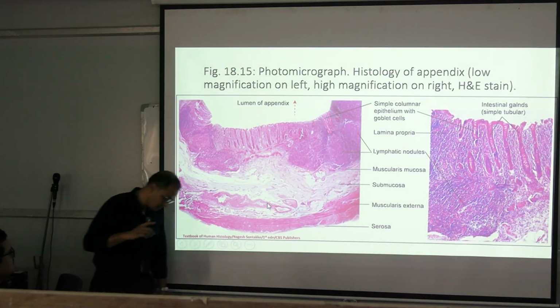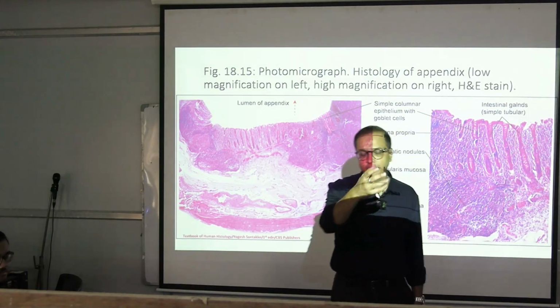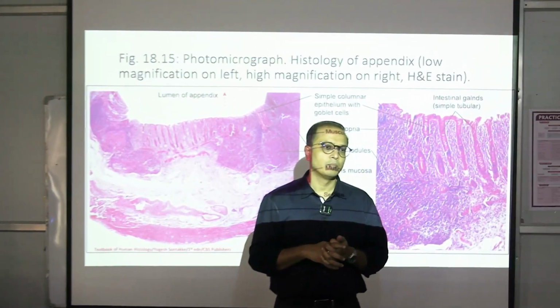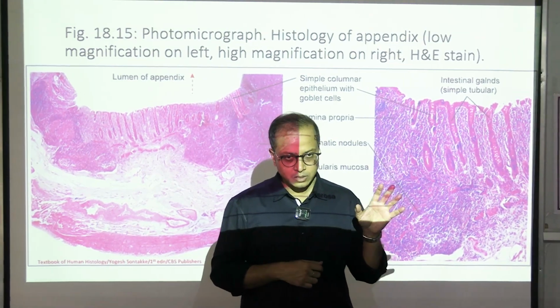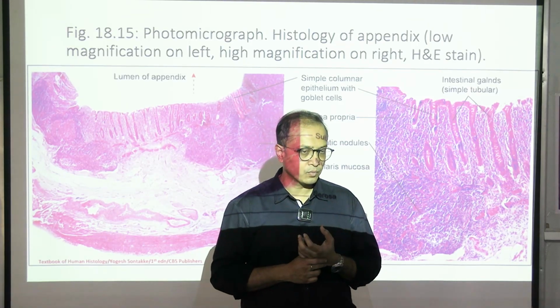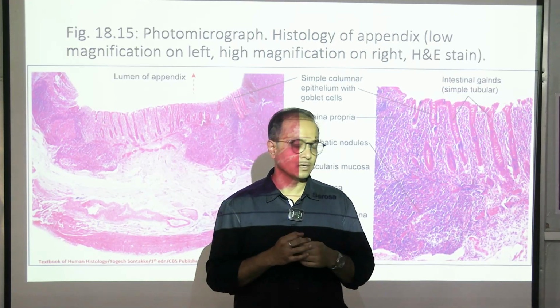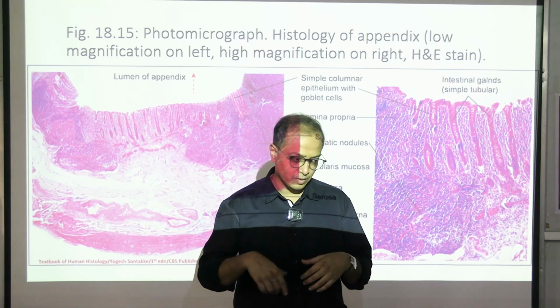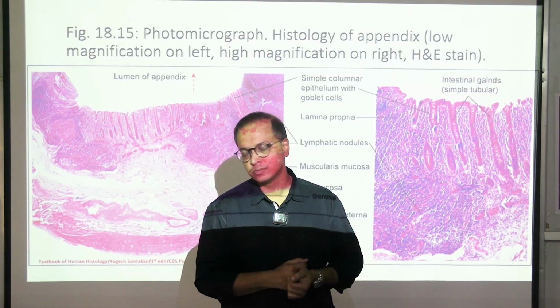We have just two slides, and one of them is really good, where you can see the layers and lymph nodes very clearly. The other one you need to reflect light on to understand the microanatomy of this appendix. To summarize, we are going to see four coats of this intestinal tissue, which does not have any villi. So, absence of villi is the thing we are going to notice. Then we have the mucosa with glands, and within it a collection of lymphoid nodes.